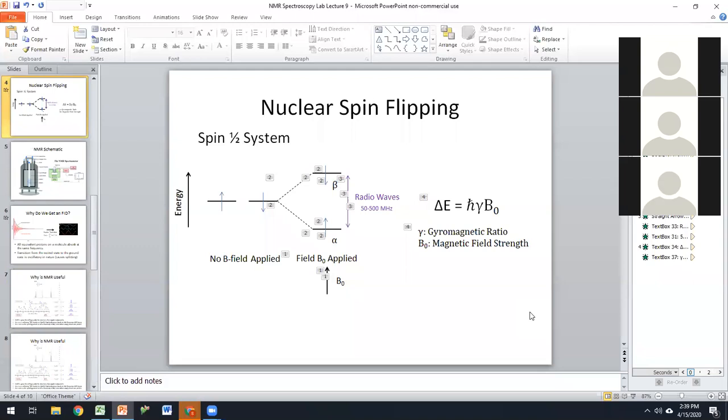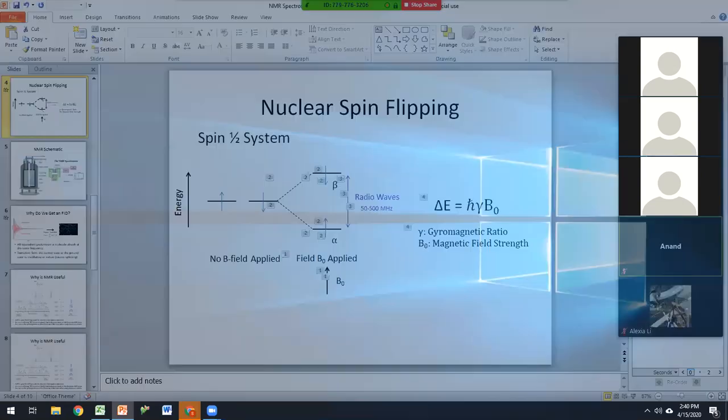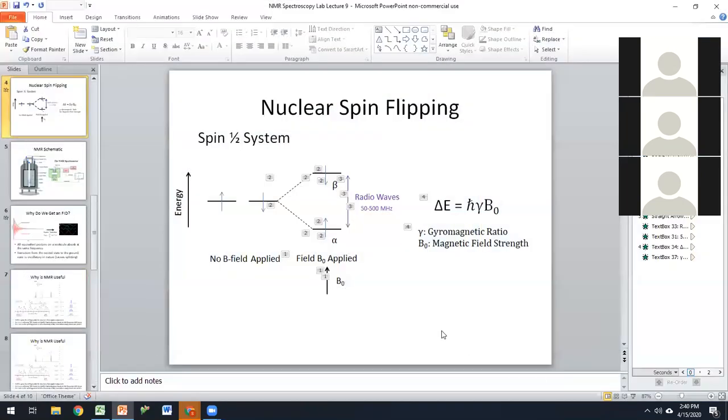For the ratios of the splitting, like the alpha and beta states, on the lab I kept getting values like 0.999 something, basically 1. Does that seem accurate? I didn't work through the problems myself yet, but it depends on the exact situation.